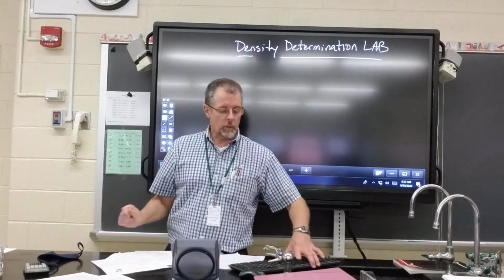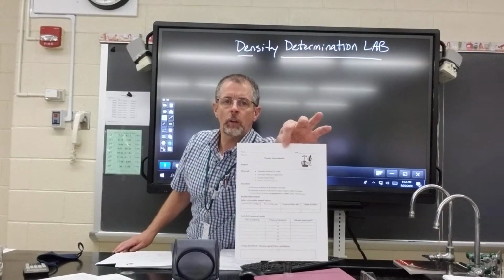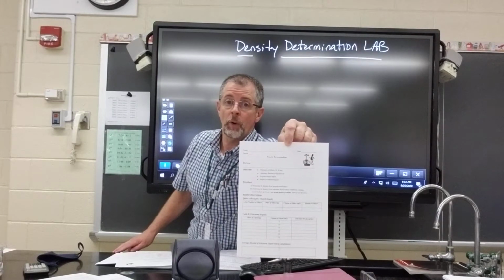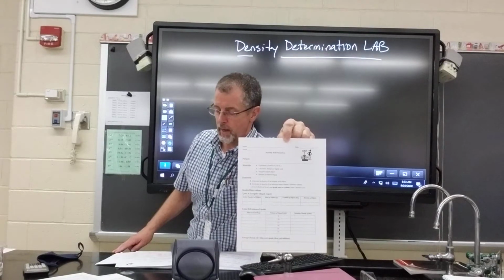Good morning. Today we're going to be working on the density determination lab. So if you go on your notebook, your class notebook, you'll find a copy of this, and we're going to do this together. So I'll take a series of measurements, and you will write the measurements down.